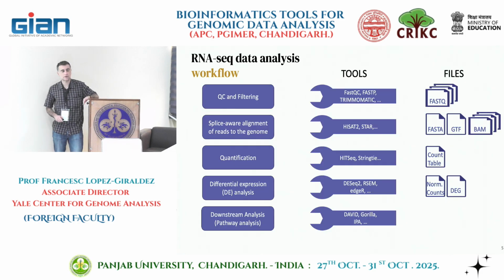So for every step, you're going to be using different software. We already saw FastQC. For filtering, we're going to use fastp. And these are the files you're going to use as an input, right? And at every step, you're going to get a different type of file, and it's going to be evolving to our final results table.